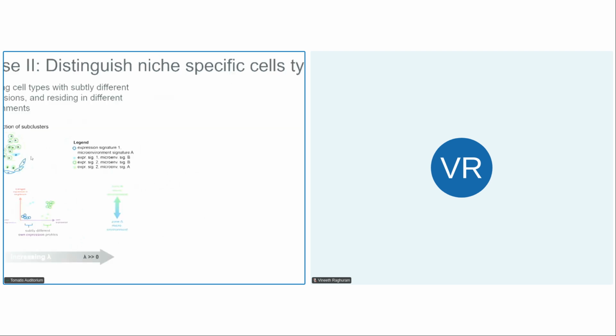And the other use case of this lifting process is, let's say you have a cell type that resides in two distinct neighborhoods. So let's say the blue cell type is at two positions along this vertical axis. There are cells of the blue cell type which have distinct neighborhoods, and generally cells tend to interact with neighboring cells, with nearby cells. And so you could imagine that the state a cell is in can be different if it's in a different neighborhood.